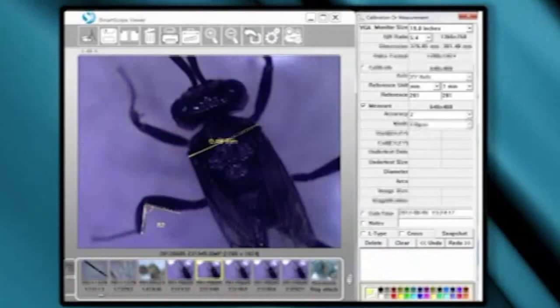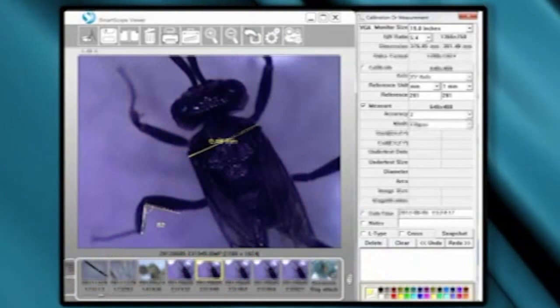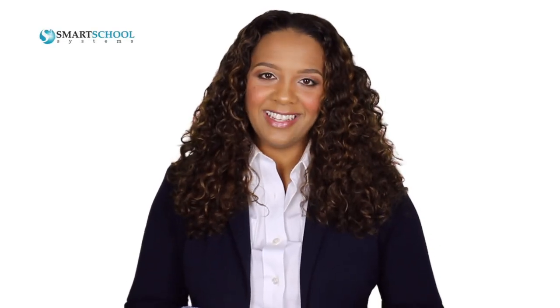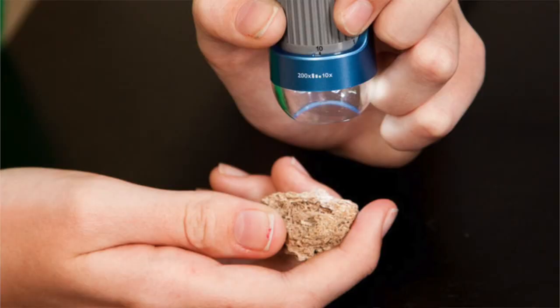This is an educational tool unlike any other, with advanced features like measurements, side-by-side comparisons, assessments, annotations, and the ability to save directly to Google Drive. Our learning portal includes 20 elementary, 20 middle school, and 20 biology investigations in the 5E model, aligned to over 25 state science education standards and the NGSS.